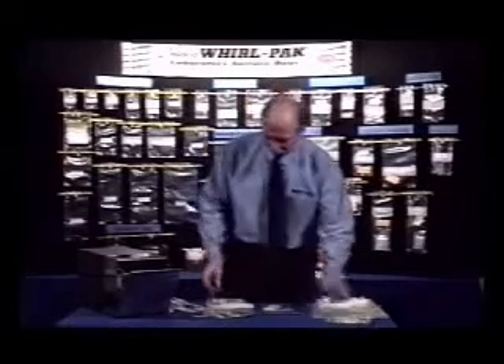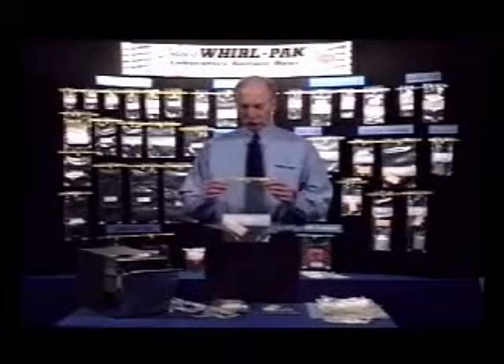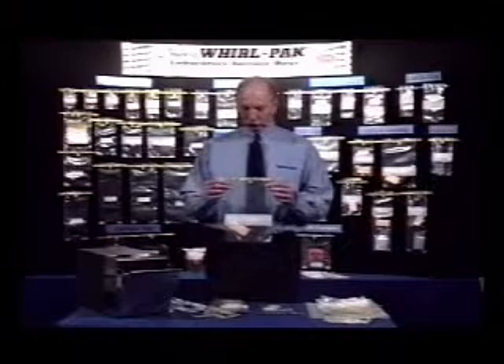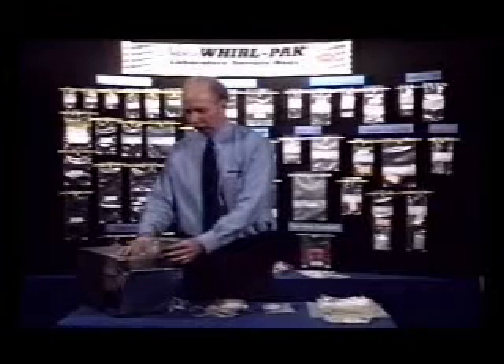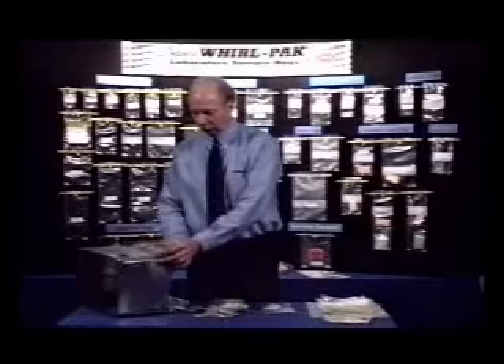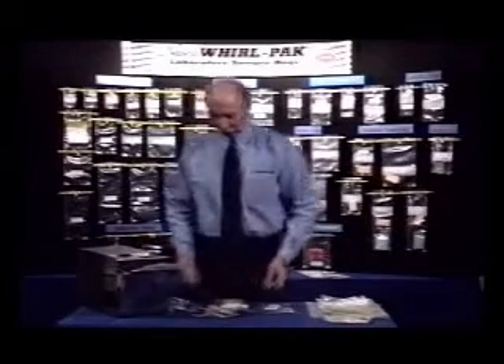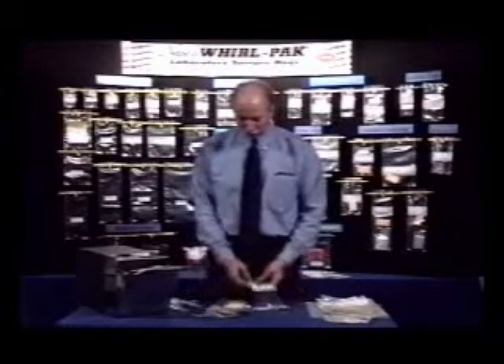A second sponge bag, much larger, is designed to have media added to the bag after the sample has been collected. The bag is placed in a homogenizer blender and the media, sample, and sponge are mixed together to remove as much sample from the sponge as possible. The sample can be pipetted out and plated, or retained and used later as a pre-enrichment broth.